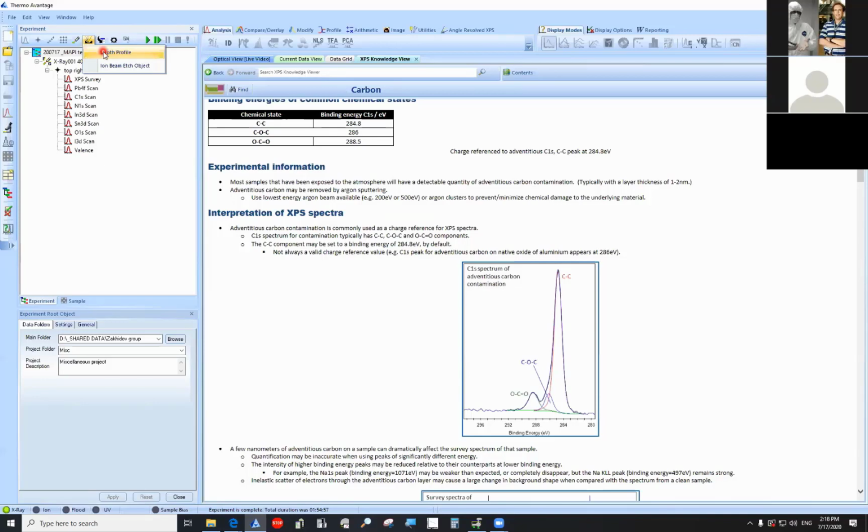And that depth profiling can be done with either monatomic argon, which is best for moving inorganic species out of the way. We also additionally have the option of using a cluster source, which is supposed to be better for milling through things like polymers or organic compounds. All right, did that answer your question sufficiently?